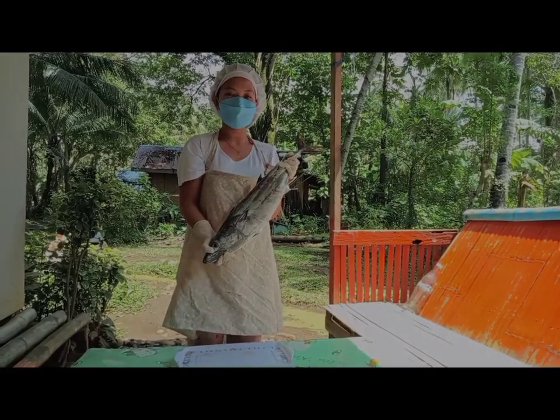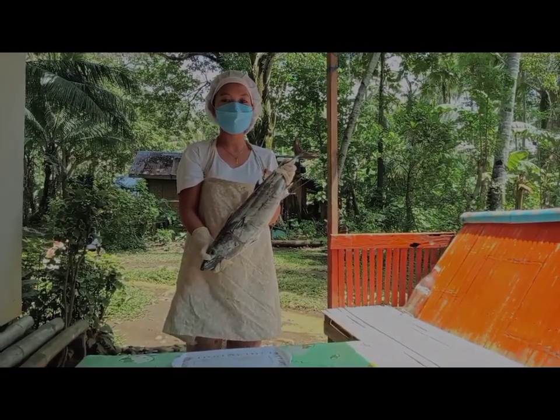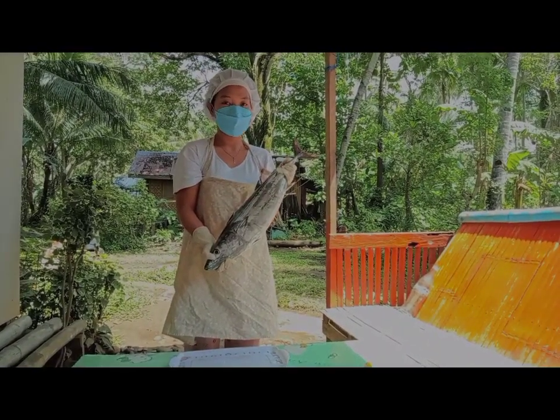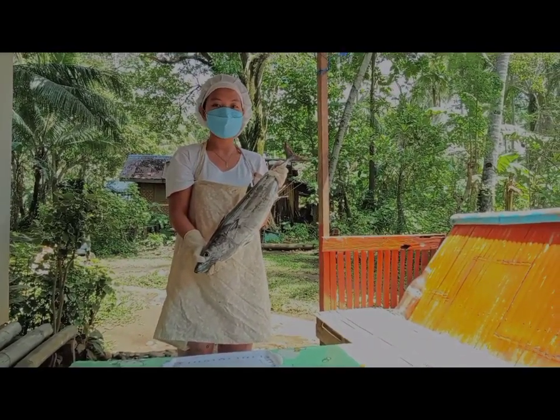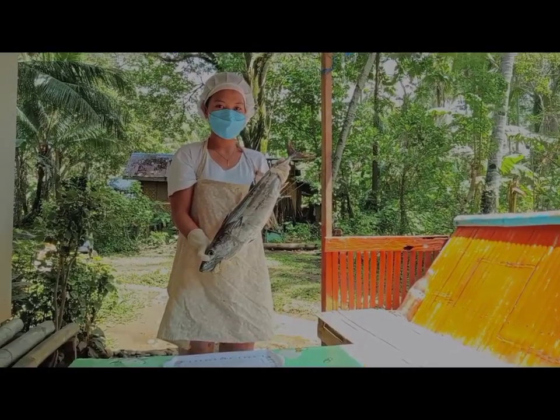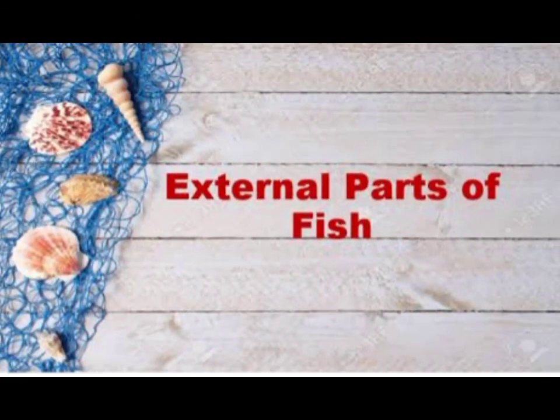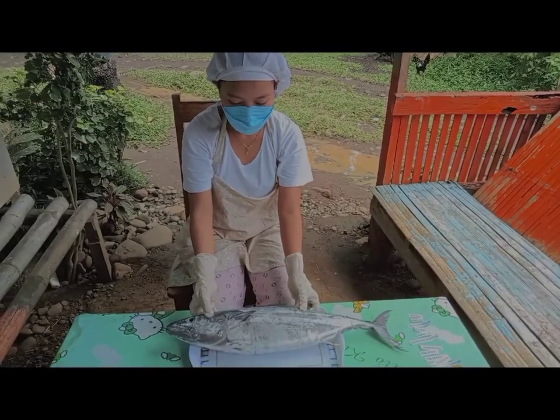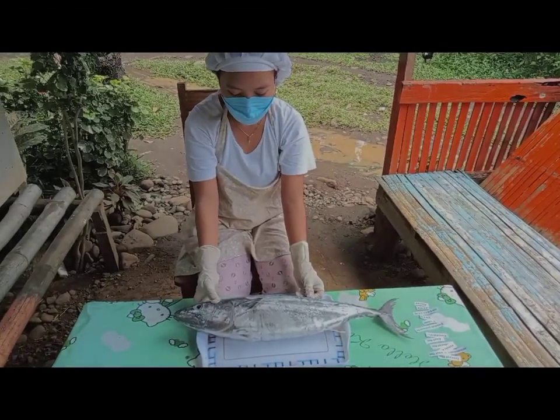For today, I will show you the external and internal parts of Katsuwonus pelamis or Skipjack Tuna, also locally known as Bangkulisan. Let's identify first the external parts of Bangkulisan.